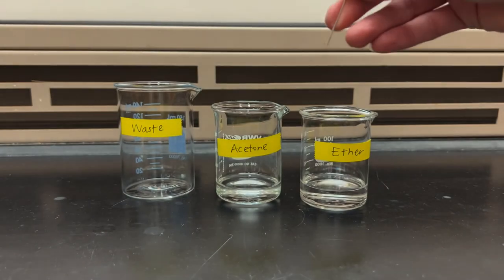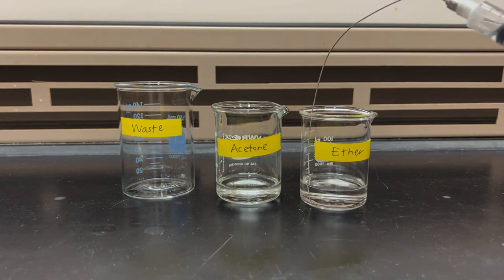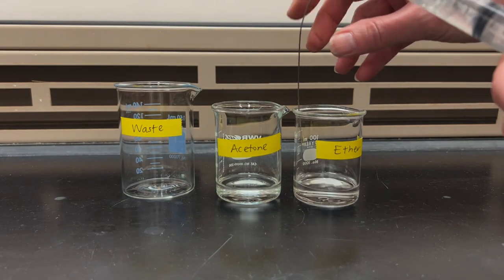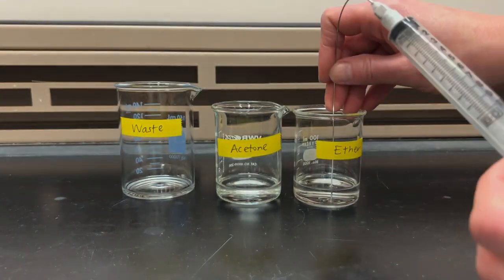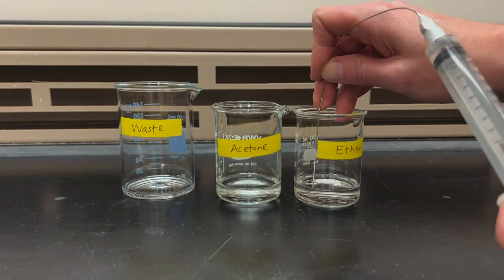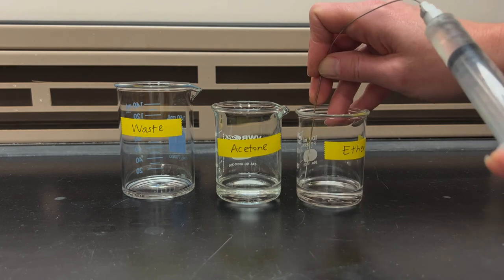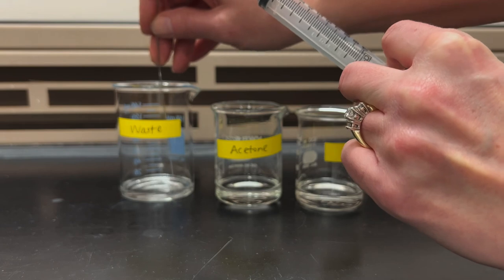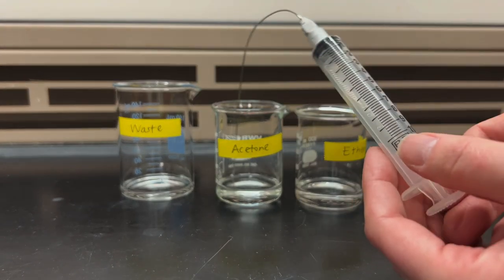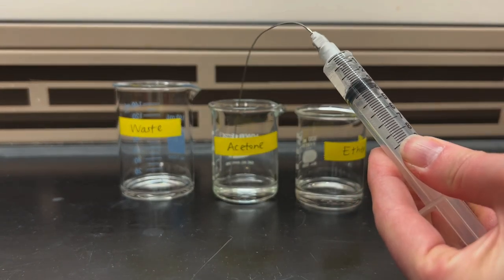When you're ready to clean your syringe then just bring it to a waste station and give it a series of rinses. Start with a solvent that the reagent should be soluble in. Like if it was a solution in ether then you want to start with ether. Rinse that out twice or so. And then follow it up with acetone and then your needle should be clean.